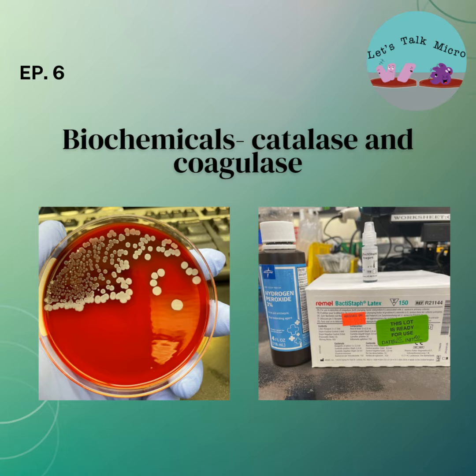So, in today's episode, we are going to be talking about biochemicals. What do we use them for? Well, it's one of the tools we use for identifying our organisms. So, at this point in time, you are an expert microscopist. You know how to read and report a gram stain, either blood culture or regular gram stain. Your organisms have been plated in the media that we talked about, and they've been incubated, right? So now they're ready for us to take a look at.